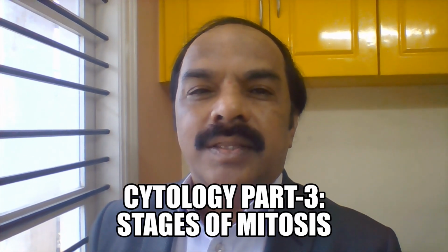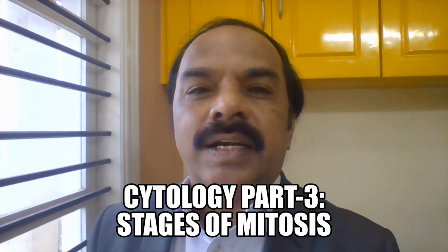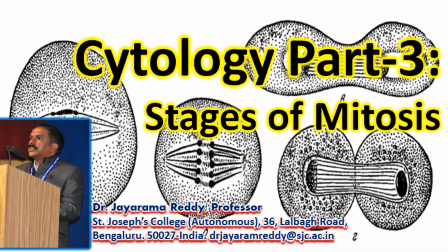Welcome back. In this part, I'll explain about the different stages of mitosis as a part of cytology practicals. Mitosis is an equational division. It occurs in all the somatic cells, and a parent cell will divide into two daughter cells, and both the daughter cells will receive the same number of chromosomes and same amount of DNA without any alteration.